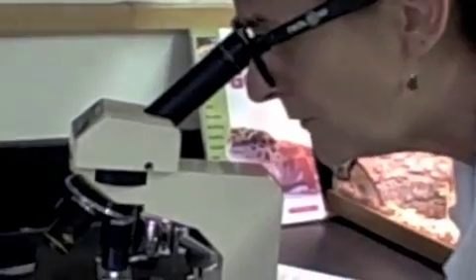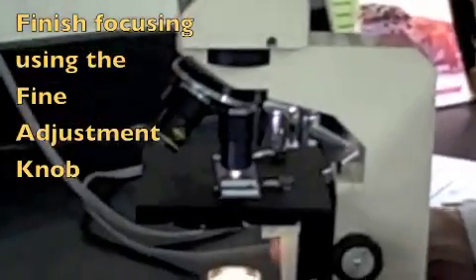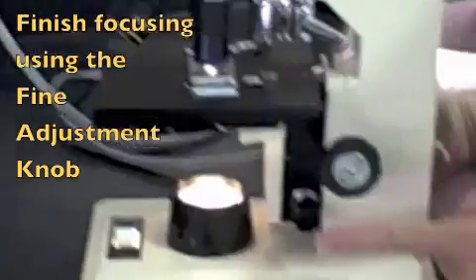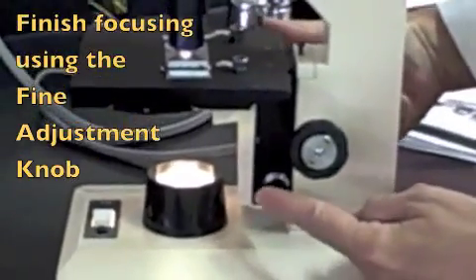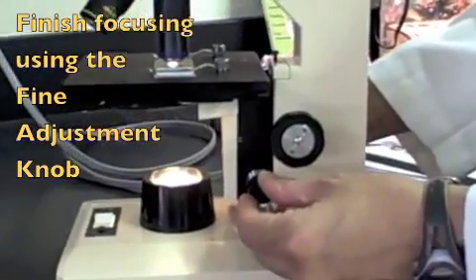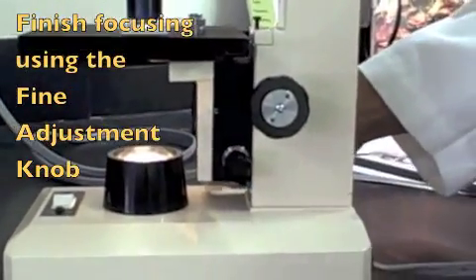Now, I'm going to look through the eyepiece and I will finish focusing using the fine adjustment knob. This is the small knob here. So, I'll make any fine adjustments using this knob.